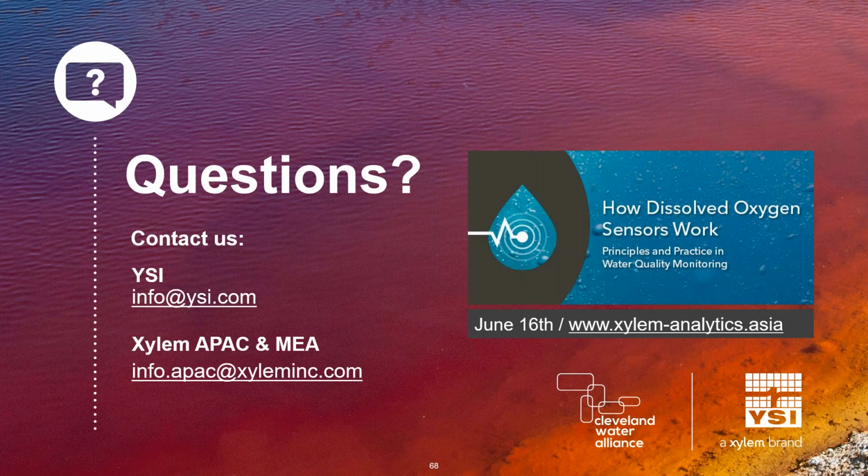Okay. Why is it that sensors like the NH4 and Cl ISE sensors are not meant for use in seawater, whereas the pH sensor can be used in seawater? That's a great question.